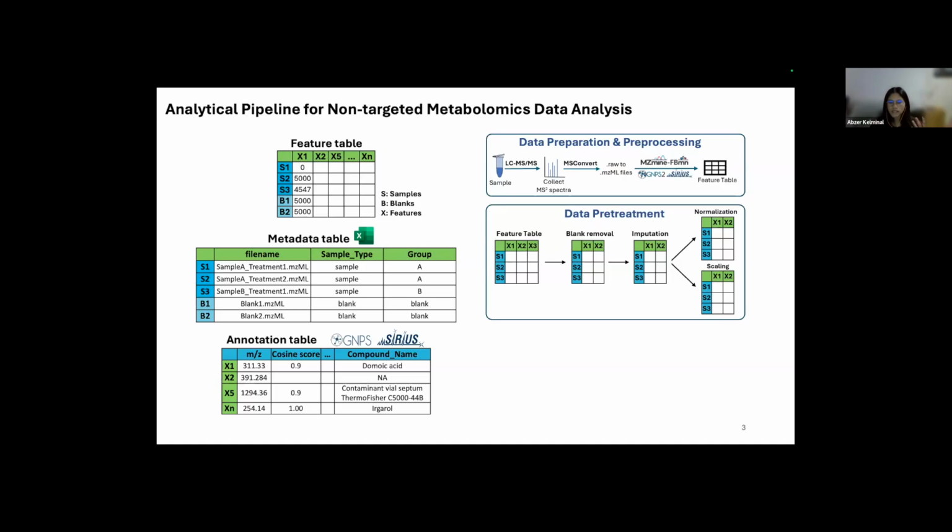Here we try to replace the zeros with a minimal value and try not to introduce additional variation as well. So here we assume that these zeros are not true zeros, but maybe values that were not detected because of the instrument's limit of detection. Zeros could also be problematic sometimes in some statistical tests such as PCA, so we also try to replace these zeros in imputation.